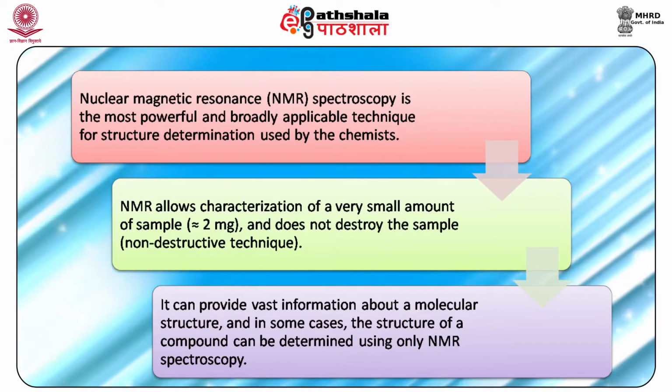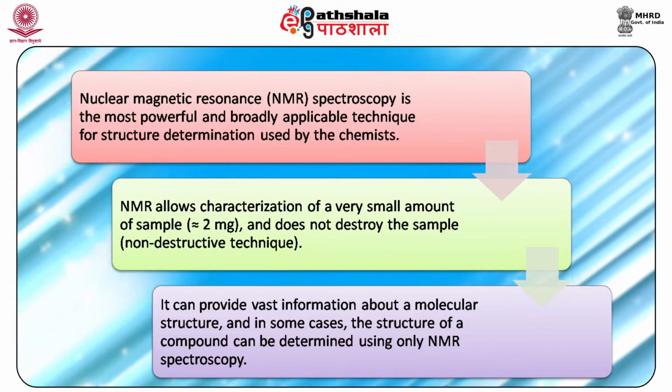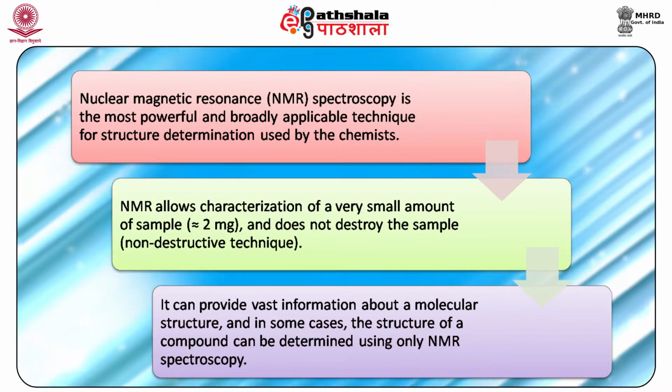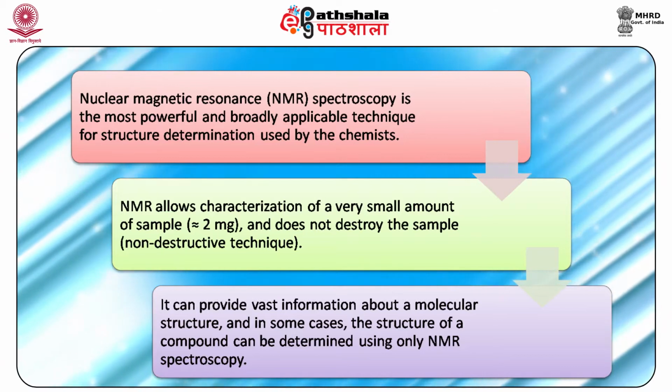Now students, we shall slowly come to the topic and explain in detail every single detail of nuclear magnetic resonance spectroscopy to you. Now coming on to another important introduction of NMR spectroscopy. Nuclear magnetic resonance spectroscopy is the most powerful and broadly applicable technique for structure determination used by chemists today.